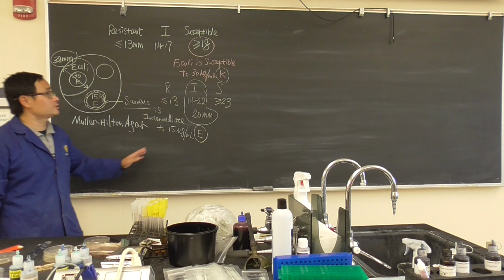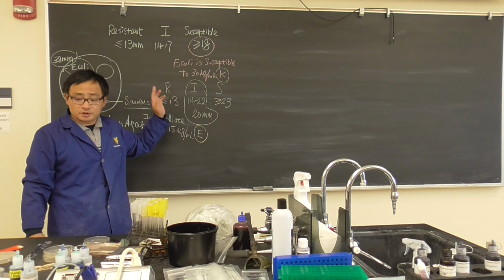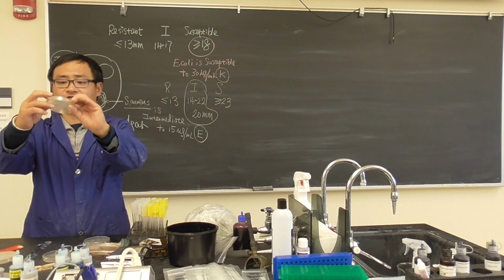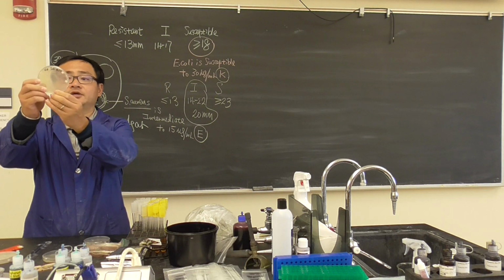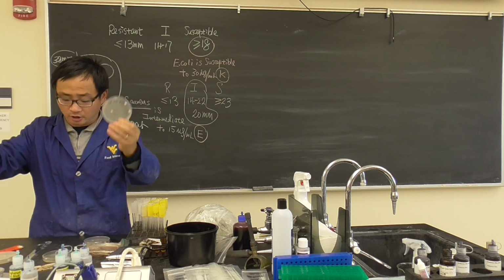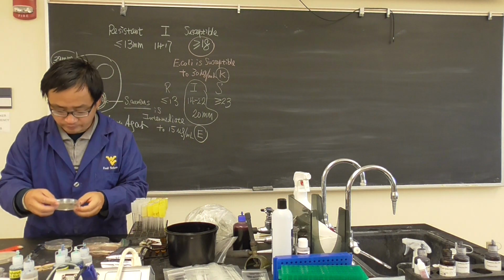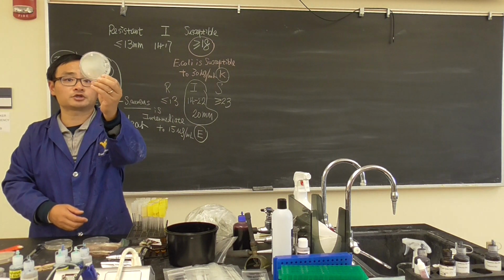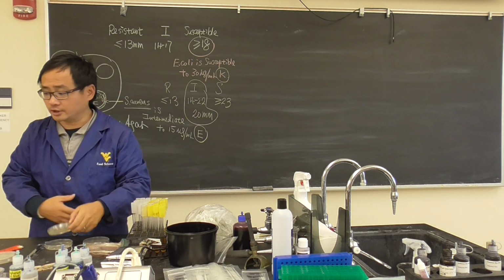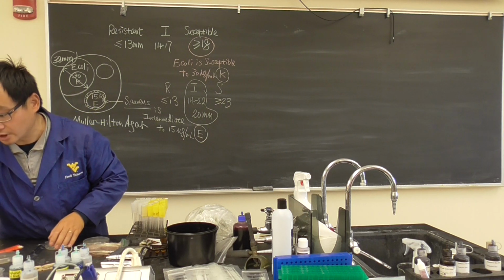Okay, if you find something is resistant on some of your plates, let's say right here, this is a Staphylococcus aureus. When we see clear zone there, which is almost nothing, it means obviously it is resistant. Okay, this one is also a good one. Tetracycline, you see, really good. Tetracycline 30. Let's look at tetracycline 30.